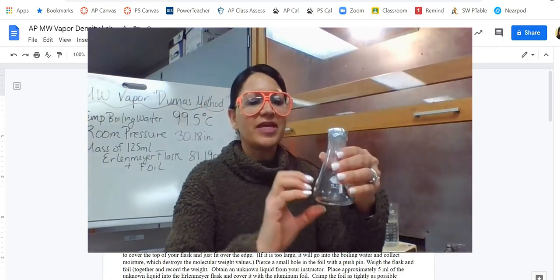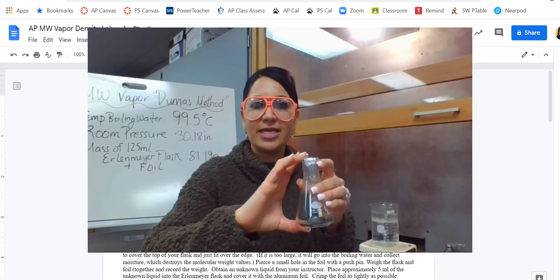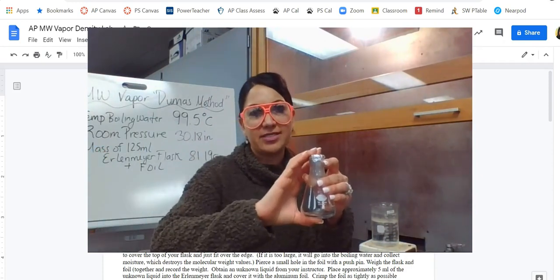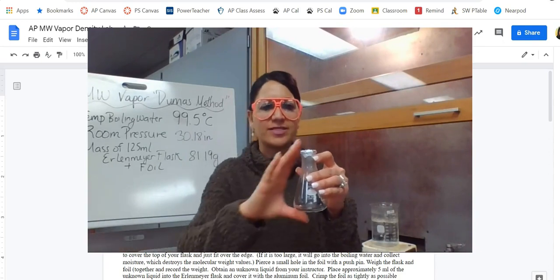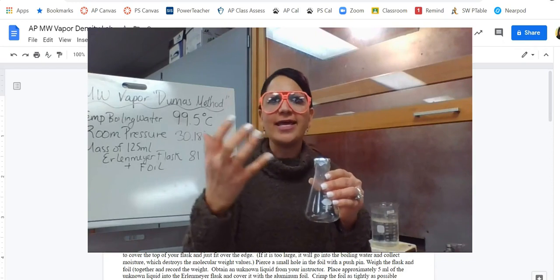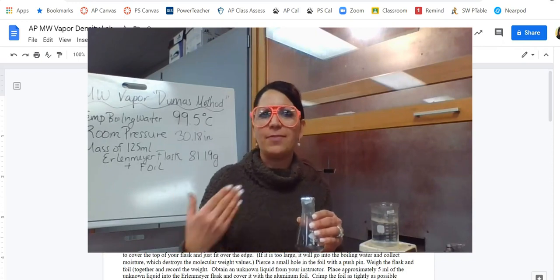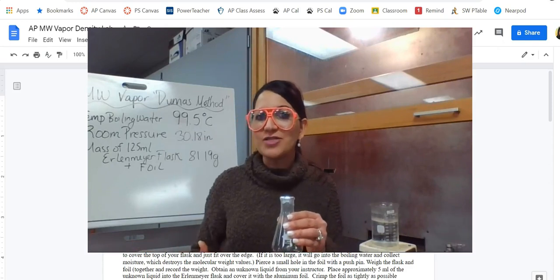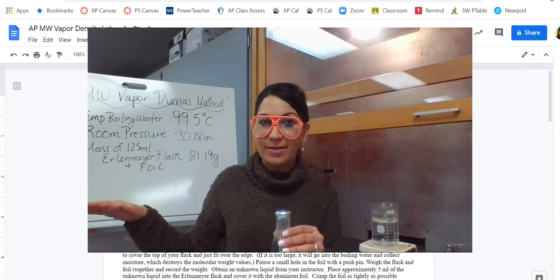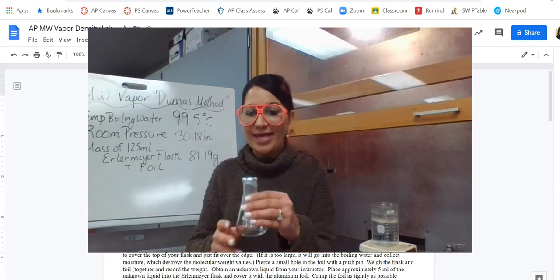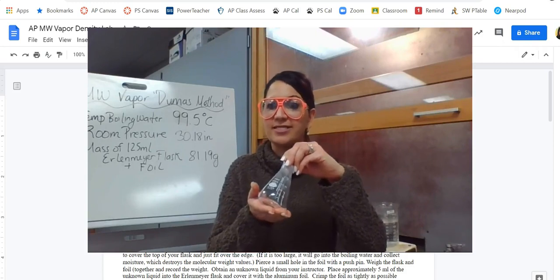So what has happened is the gas filled up inside of here, kicked out air, kicked out anything else that was there, right? And so it filled it, and once it reaches an equilibrium with the outside pressure, then it stops leaving, it stops evacuating. And so that's when effusion will stop, when the inside molecules are spaced out just like the outside molecules are. So then once I cool it down and I turn the gas back into a liquid, a lot of times people have a misconception that gases don't weigh anything but liquids and solids do. That's not true. So by the law of conservation of mass, if I have a certain number of particles, whether they're in the gas, the liquid, or the solid state, they weigh exactly the same. So you want to make sure that you have that down, that they do weigh exactly the same.